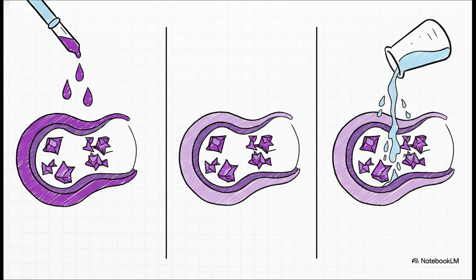When alcohol hits the gram-positive bacteria, their thick wall dehydrates and shrinks, trapping that dye complex inside. They stay violet. But the gram-negatives? That alcohol just dissolves their outer membrane, and the thin wall can't hold on. Poof! The dye washes right out, leaving them completely colorless.